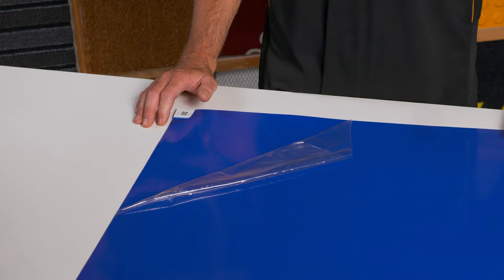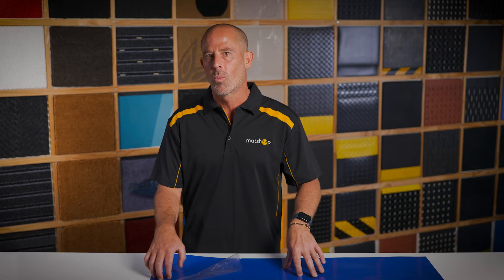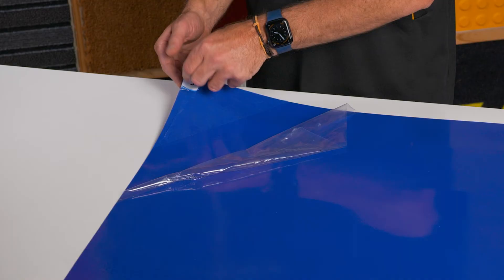This mat has a sticky surface that traps dirt and an adhesive underneath that fixes to the floor to keep it where you need it. Once the top sheet starts to get full, you can just easily tear it off and reveal a brand new layer underneath.